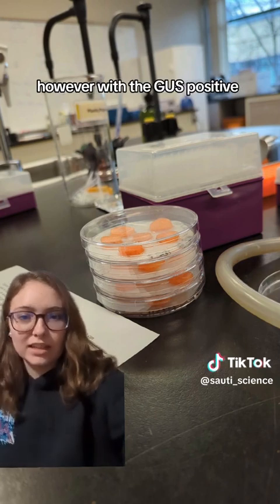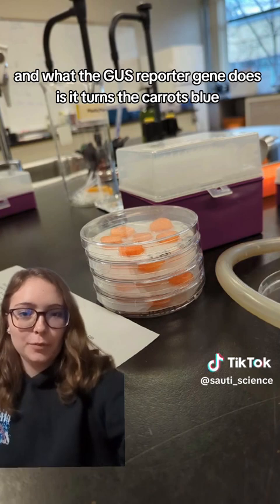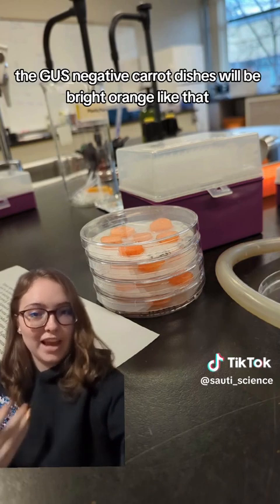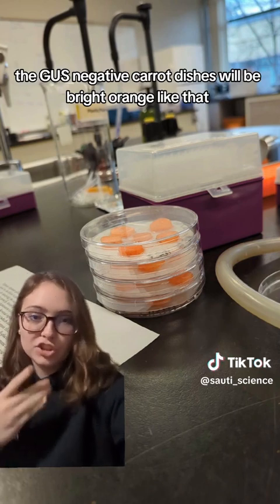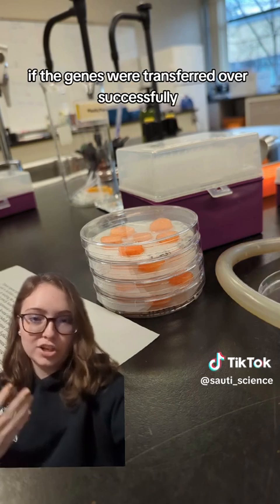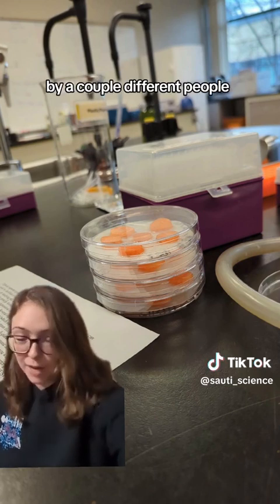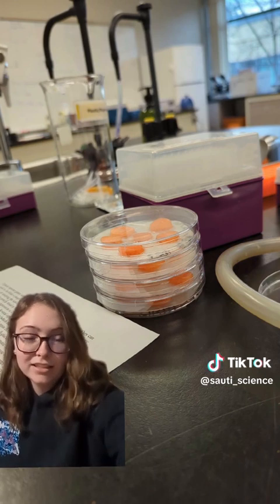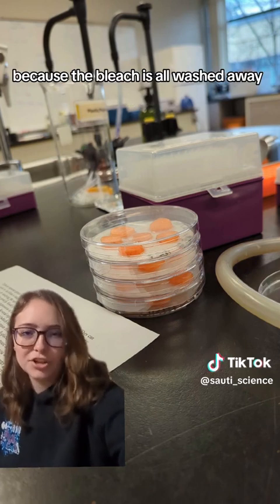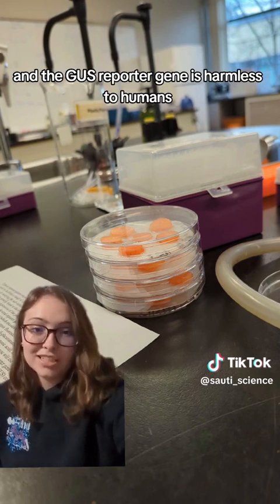However, with the GUS positive, they have the GUS reporter gene, and what it does is it turns the carrots blue. So coming back next week, if the transformation was successful, the GUS negative carrot dishes will be bright orange, but the GUS positive dishes should have blue in them if the genes were transferred over successfully. I was told by a couple of different people that it is a bad idea to eat the transgenic carrot, even though nothing would probably happen because the bleach is washed away and the bacteria is harmless to humans, and the GUS reporter gene is harmless to humans.